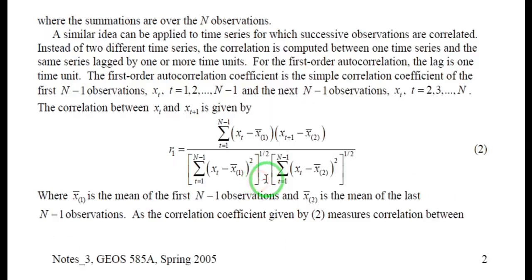Well, the formula which is represented here is for the discrete form of the data. I mean that the data are not continuous. However, if the n goes to infinity, then this will be transformed into an integral.